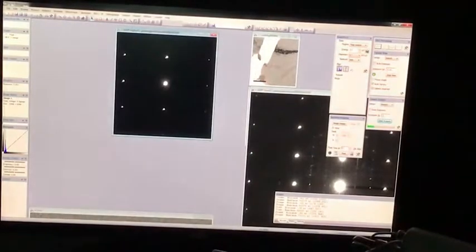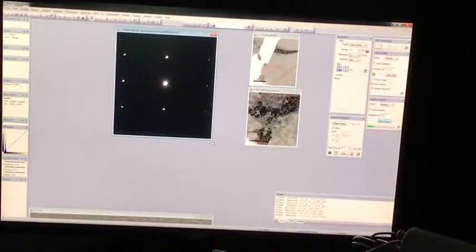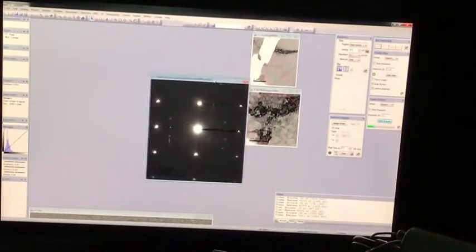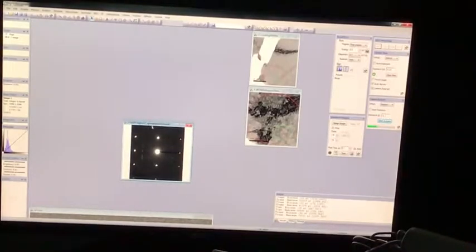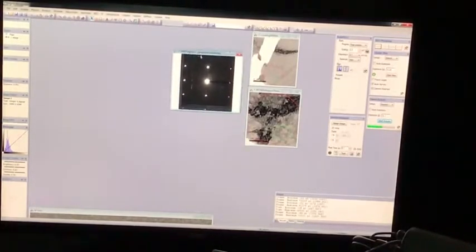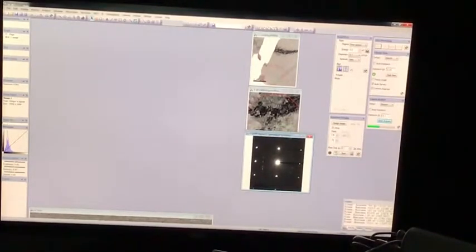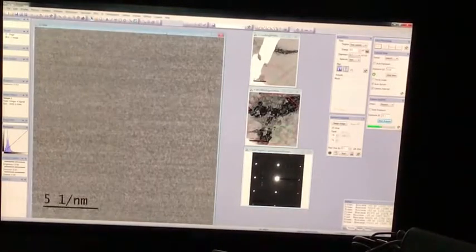That's a key clue to doing this lab. So I'm just going to close that, and we don't need this anymore. I'm going to close that. And so this is the green region of interest. I'm going to improve the contrast a little bit so we can see what's going on. It's a bit ratty, isn't it? My goodness. So I'm going to move this away. Okay, so back with our view.